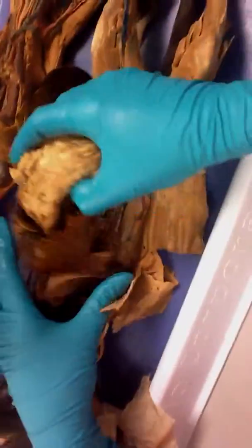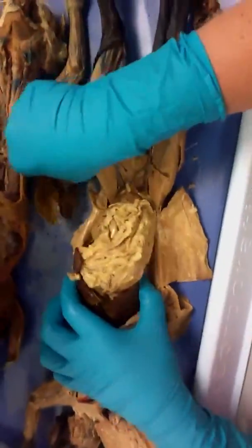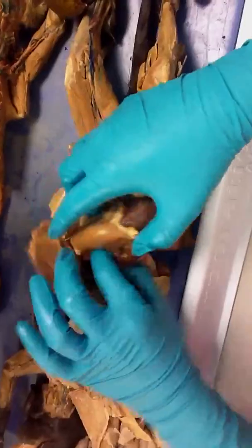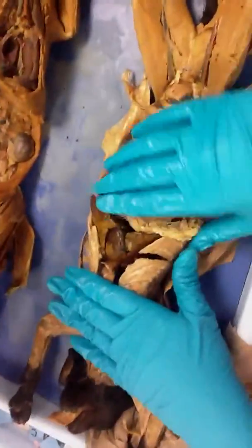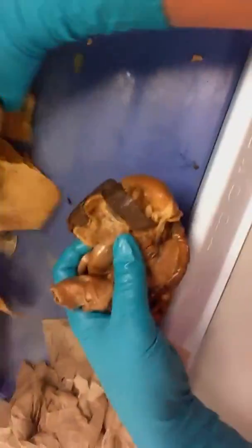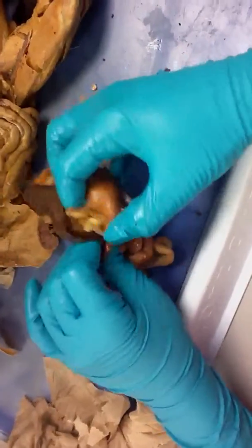Okay, so then the food leaves, continuing to trace the food's process through the digestive tract. It comes down through the esophagus into the stomach, and the stomach is sitting up here close to the heart. Okay, so our very first sphincter in the stomach is called the cardiac sphincter.